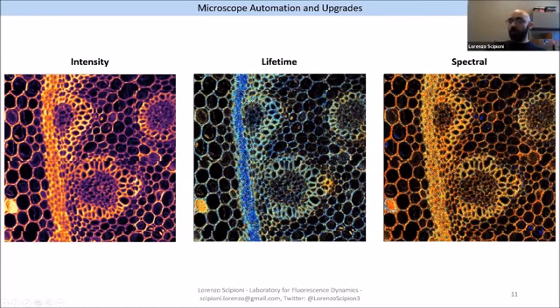So that's very useful for classification, because that's why I call it multidimensional microscopy, because it gives you more layers of information than simple fluorescence intensity. Now, this is blind. Let's say we just look at the things. It has pretty colors, so we're happy with it. But we can also do something more in depth.